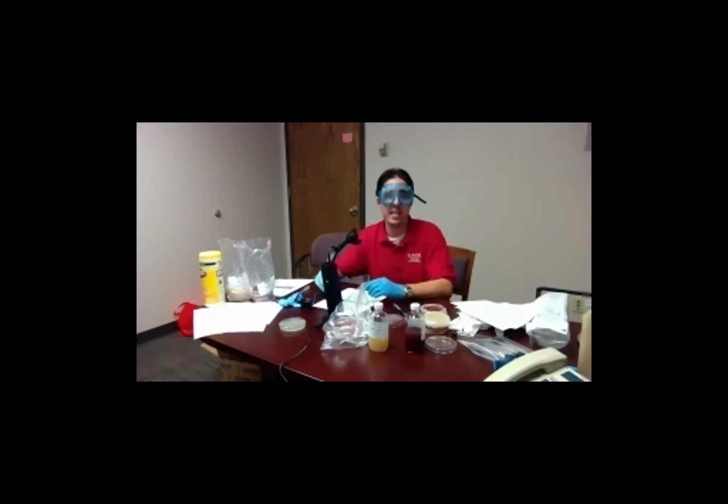And it explains the difference of gram-positive bacteria and gram-negative bacteria, and that you're growing gram-negative bacteria as the coliform. So there's a lot of educational material that you should use in your course and help train your team, because some of it could be on the team exam portion as well. Because if you'll notice on your sheet, I've indicated that things come from the Carolina kit as well as the exercise in the lab manual, which is similar. But for the actual practicum, we're following what you just saw today.